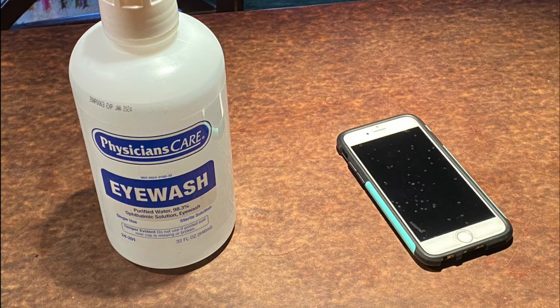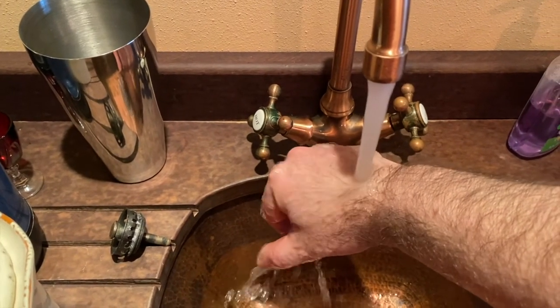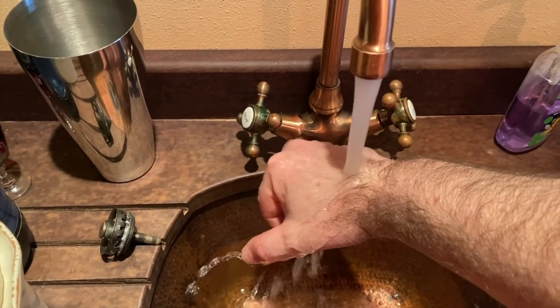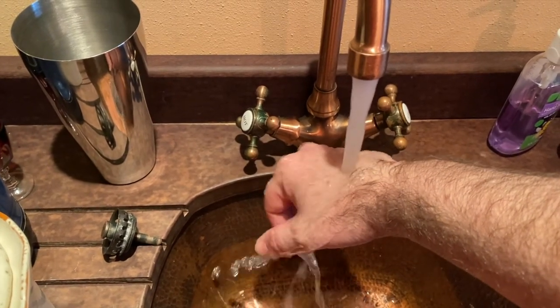Finally, even if we do everything right, it's still possible a spill or accident could occur. Your plan also needs to include contingencies in case something goes wrong. In my case, I've prepared for accidental skin or eye exposures by working near a sink, where I can get supplies of clean water for diluting any alkaline on skin, as well as a pre-prepared eye wash solution in case anything gets in my eyes.